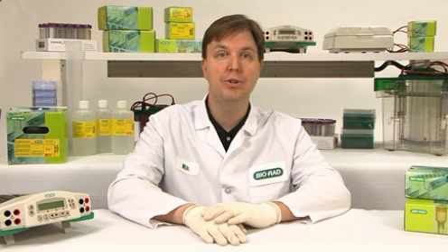I hope you have found this video comparison helpful. We are pleased to introduce the TGX gel to you. It's a high quality precast gel with improved ergonomic cassette design based on feedback from scientists like you. For more information on the TGX gels, go to www.miniprotein.com.